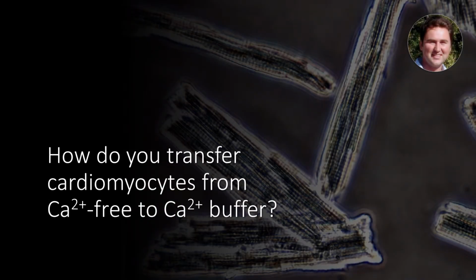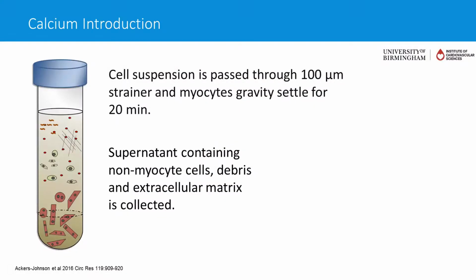I'll move on to the next common question that I seem to be getting as well, and that is, how do you transfer cardiac myocytes from calcium-free to calcium buffers? Now, I won't spend too much time on this, but I just want to reiterate the point again, particularly because both Matt and Ronglih have discussed it in this Q&A session, but also Ronglih has discussed it previously in the previous webinar.